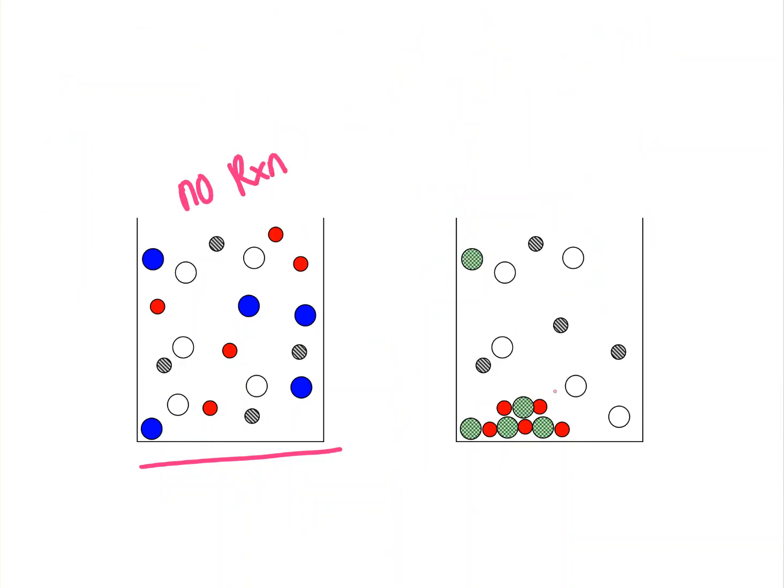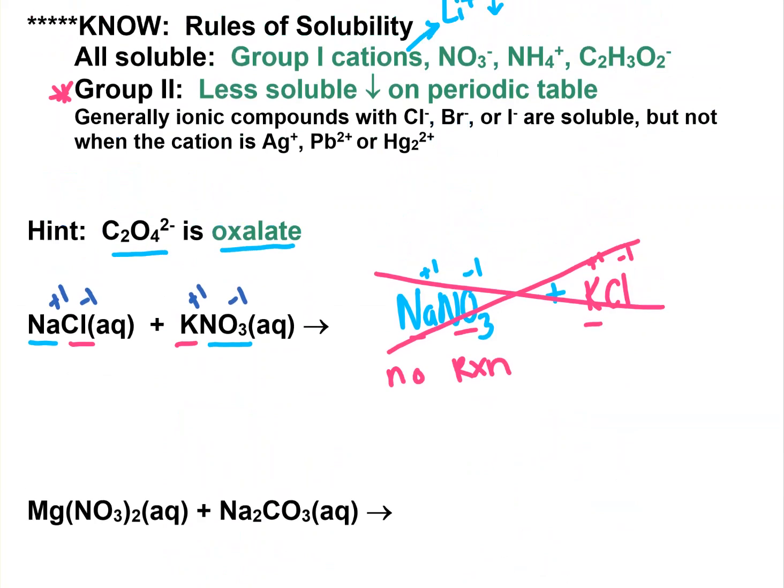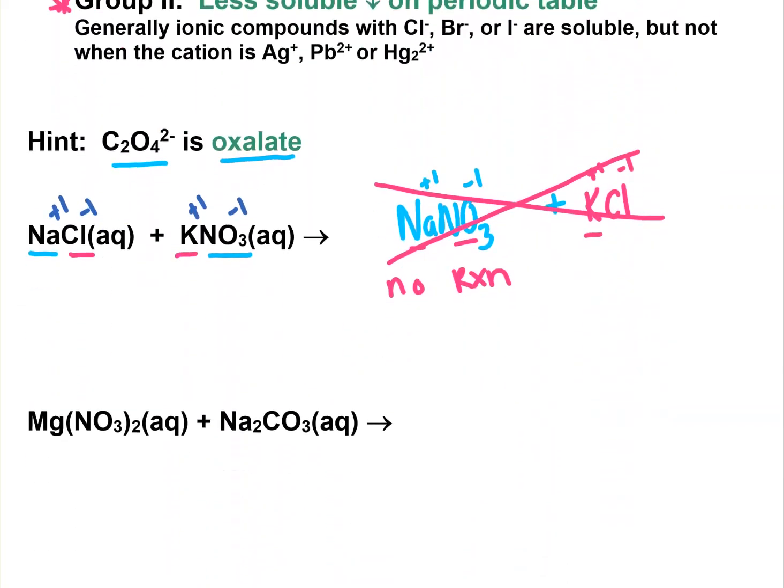This is a case where you put 4 together and then 2 of them find each other and form a precipitate, and that's why you have a chemical reaction. So on this one, no precipitate means no reaction. Let's write products on this one. And let's just say it was given, but maybe you perform the reaction and you see that there is a precipitate, then you can write what the products are. So magnesium would go with carbonate.